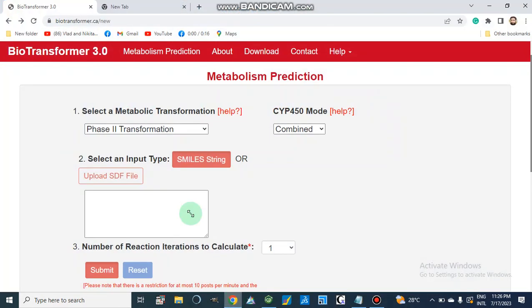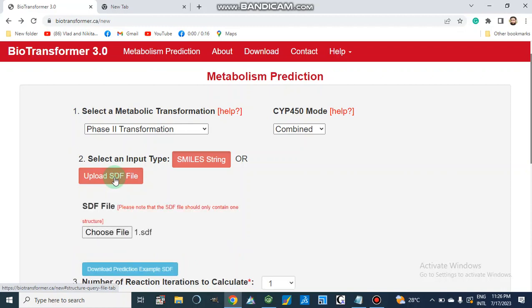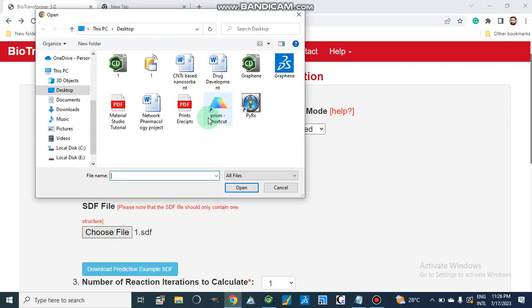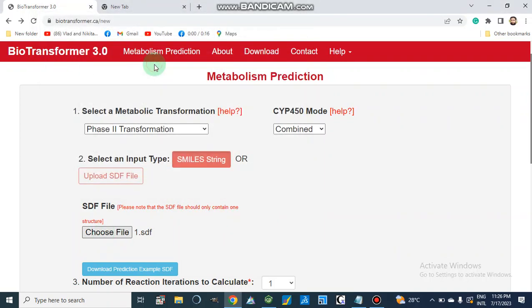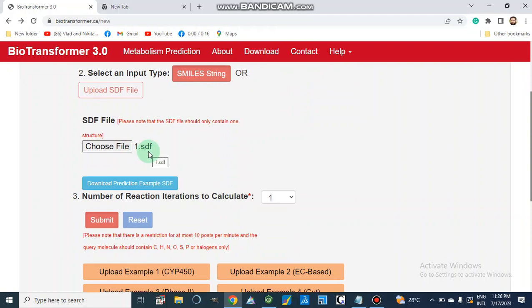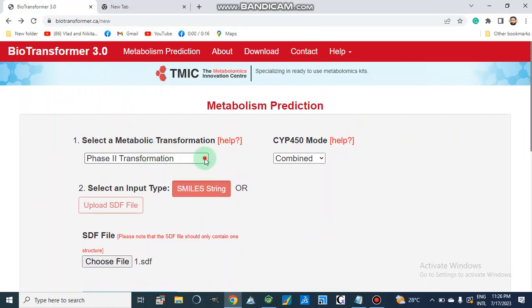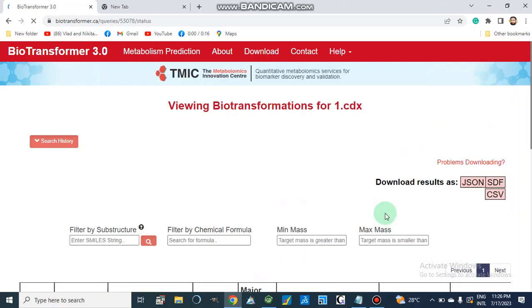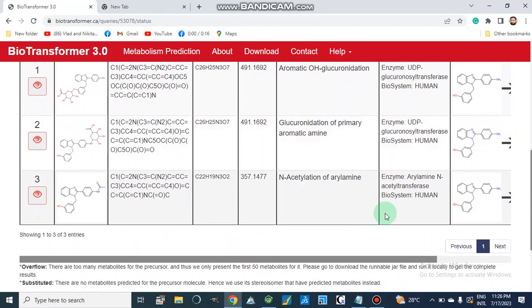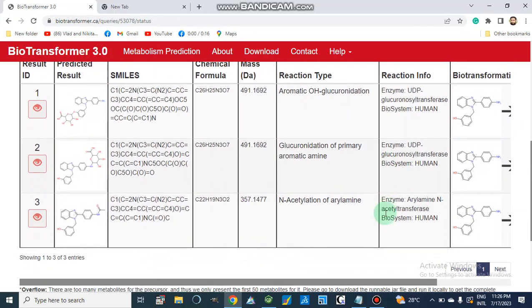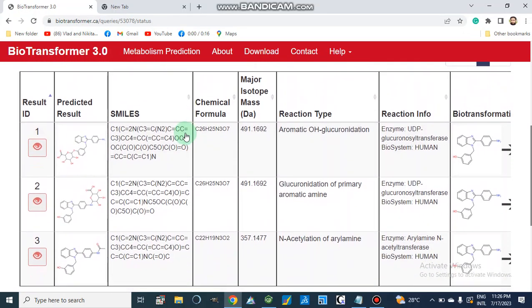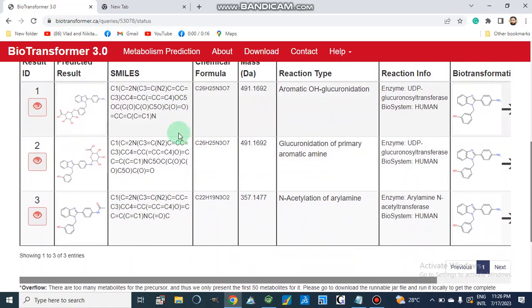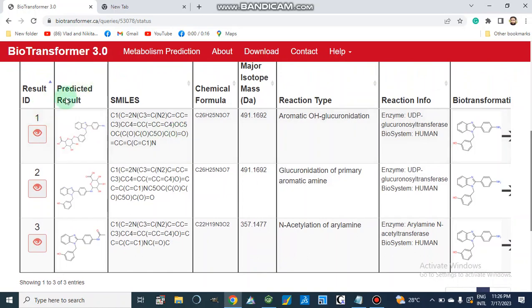In this video I am only going to upload the SDF file. We choose file from here — this is our SDF file, 'one.sdf'. Then we select the parameter; I have selected Phase 2 transformation. Then we click Submit. After some processing time it will give our results, and this is our result file.